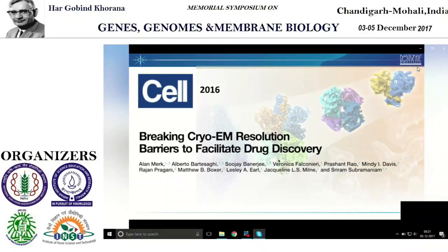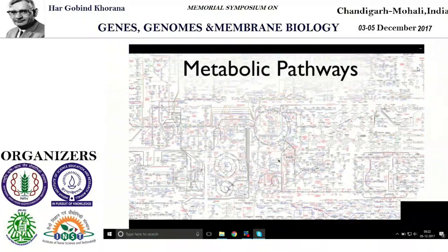And in this paper, where we reported advances on both fronts, we took on a set of proteins which are dehydrogenases: glutamate dehydrogenase, isocitrate dehydrogenase, and lactate dehydrogenase, which is in the middle. And the transition from glutamate to lactate to isocitrate dehydrogenase essentially is a progression in size that gets smaller and smaller. And IDH, isocitrate dehydrogenase one in particular, is now below 100 kilodaltons. And this was a huge milestone for us to get to.